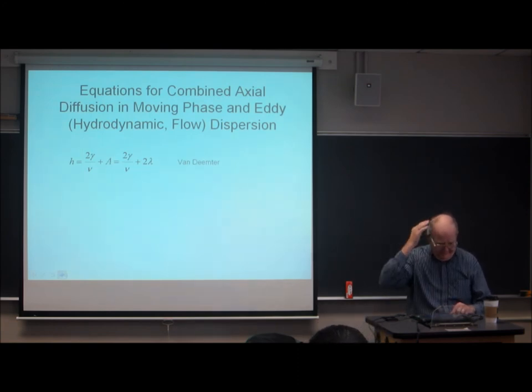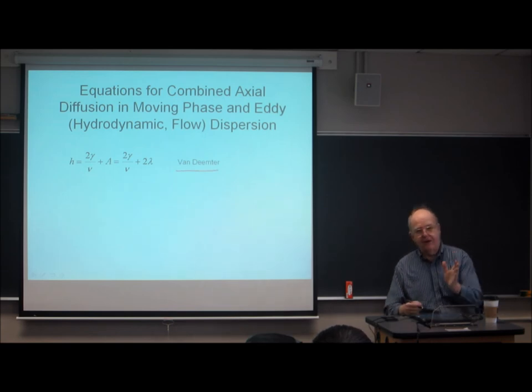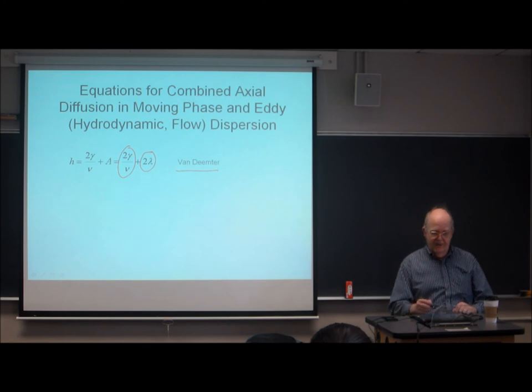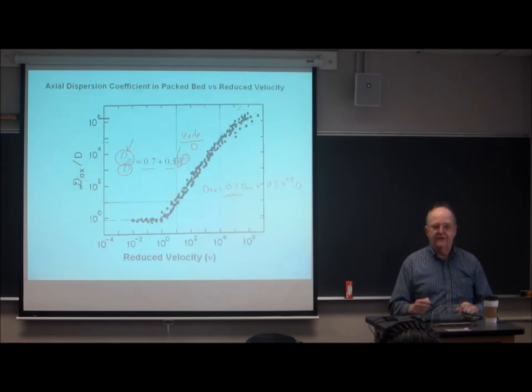Okay. So I'm going to show you a bunch of equations now that summarize the eddy dispersion. This is the Van Deemter equation, and Van Deemter says that the longitudinal dispersion in the absence of retention, this is our diffusion term, and this is our eddy dispersion term, and this eddy dispersion, according to Van Deemter, does not depend on velocity. That completely contradicts this data.